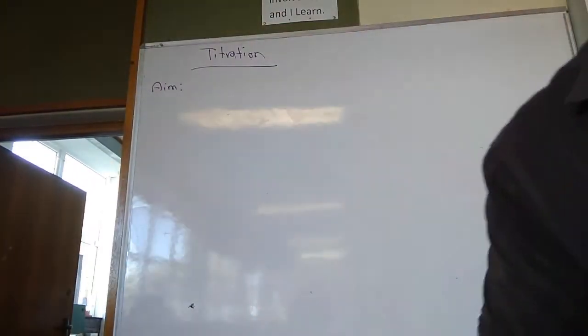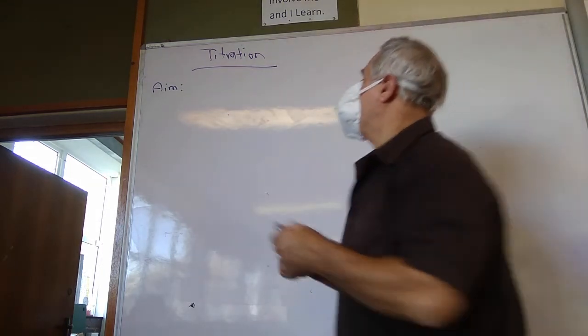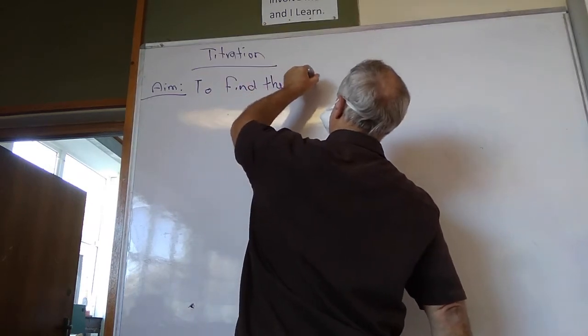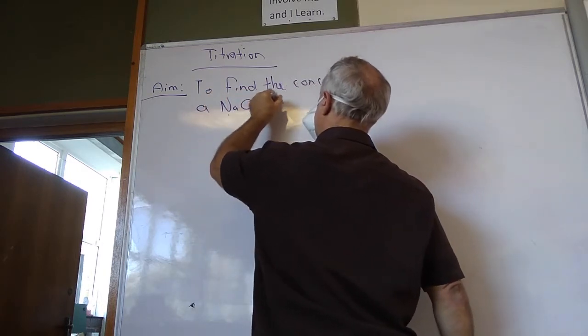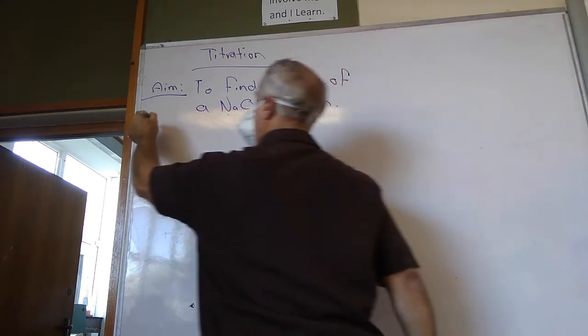Okay. What is the aim of a titration? Aim: to find the concentration of a NaOH solution. Method.